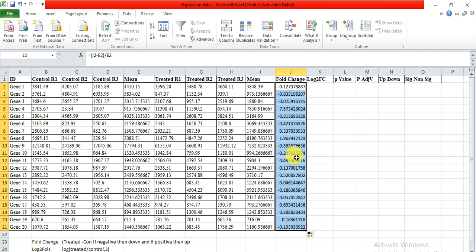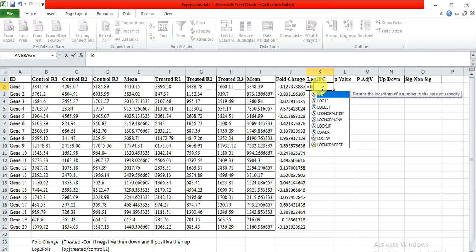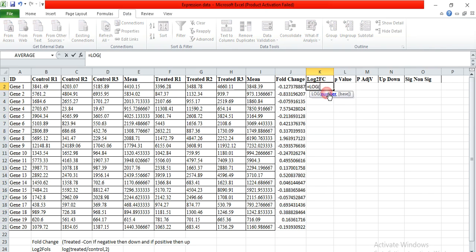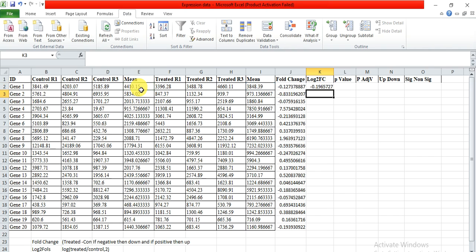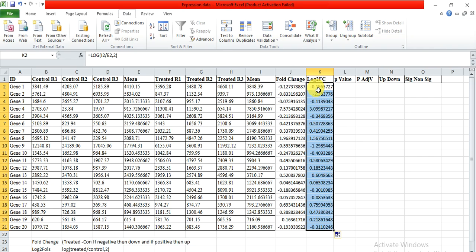In this way you can calculate the fold change. Now for log2 fold change, the formula is: equals LOG, then the mean value of treated samples divided by mean value of control samples, comma, base 2, because we are calculating log2 fold change, and press enter. This is our log2 fold change value, and it also shows negative and positive values indicating down-regulation or up-regulation.